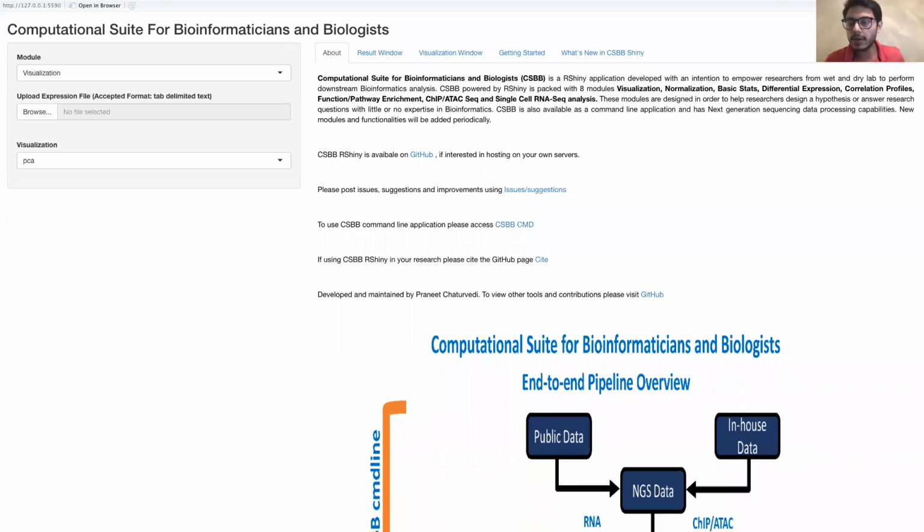So, hello everyone, myself Praneet, and today I'm very happy to share that I have just added a new module to CSBB-Shiny. CSBB stands for Computational Suite for Bioinformaticians and Biologists, and this is a Shiny interface for CSBB. Today I added a new module called Single Cell RNA-Seq Analysis. So now you can do a quick single cell analysis for your transcriptomic data.